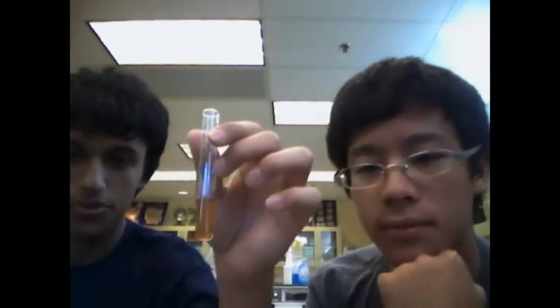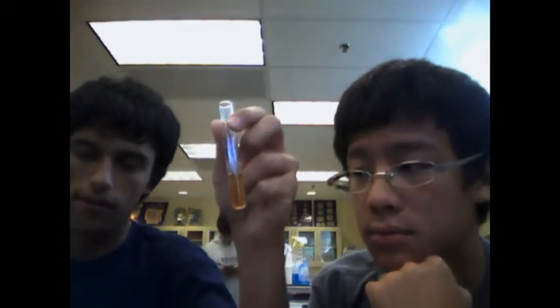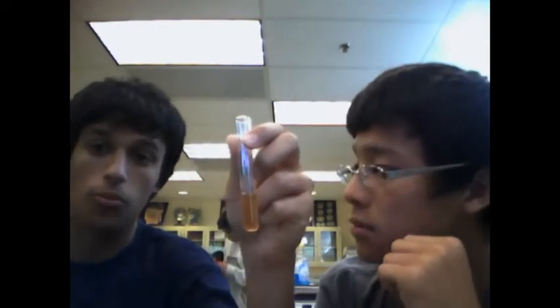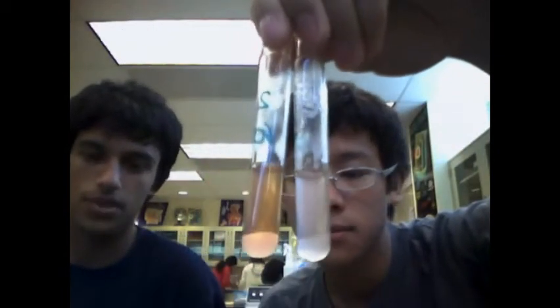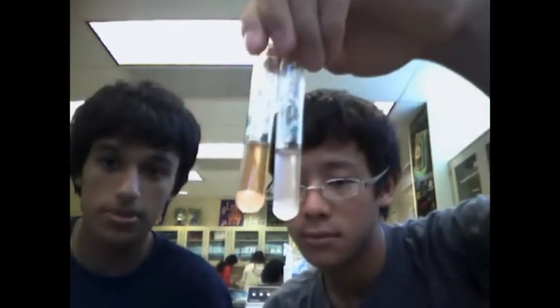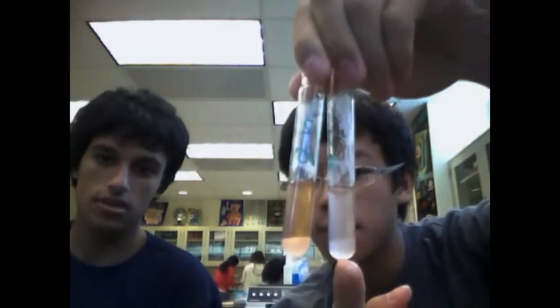Okay, so here we have our test results: 1 milliliter of catechol, 1 milliliter of water, and 1 milliliter of catechol oxidase enzyme. The same thing is added to test tubes 2 and 3 respectively. We had the same solution, but we tested this one at 37 degrees, this one at 60, and this one at 80.